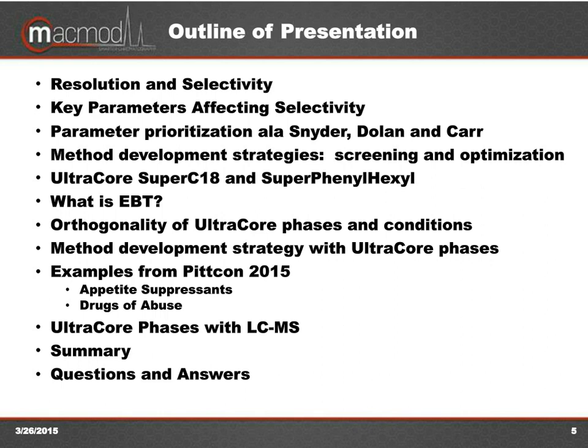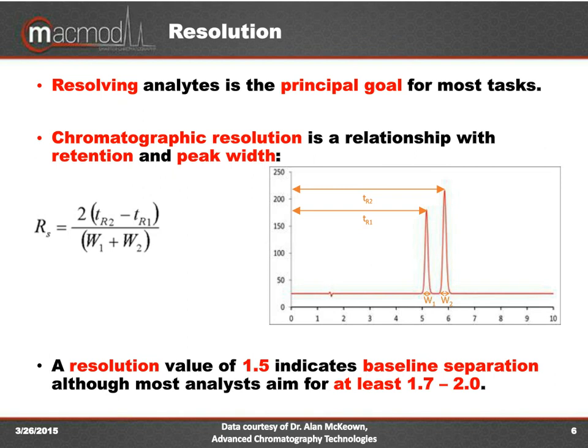Let's begin with resolution. Obviously, when you're doing any kind of analysis, you get your maximum accuracy and precision by having your analytes resolved, but you don't want to have too much resolution, otherwise you're wasting time in your separation. As we all know, time is money, and we want to get the most data and results to make the best decisions we can, the fastest we can.